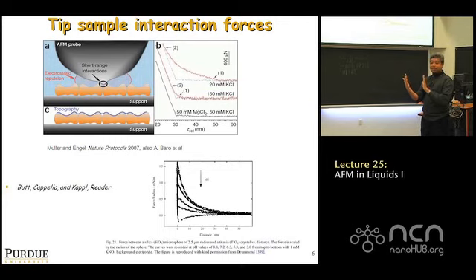And this is a repulsive force because the cantilever bends up, okay? So this would be an example of how you feel electrostatic forces, and what they do is they make this interaction force gentle. You get a gentle repulsive slope until you hit and contact the sample. After you contact the sample, of course, you have a repulsive gradient. But having a low concentration makes the interaction over a slightly longer length scale. It's not a sudden no contact and then contact. There is this gentle repulsive force region that comes up as well.